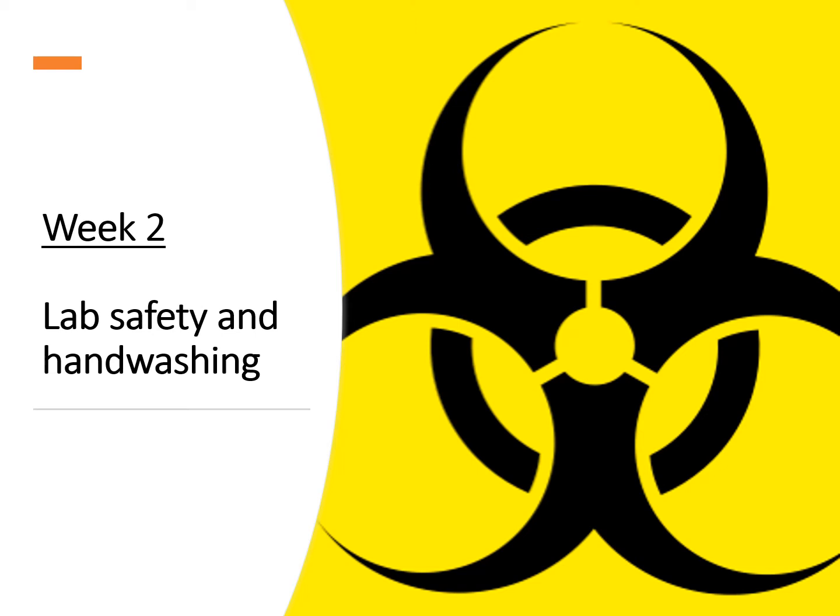Hello students, this week we're going to discuss lab safety and hand washing.